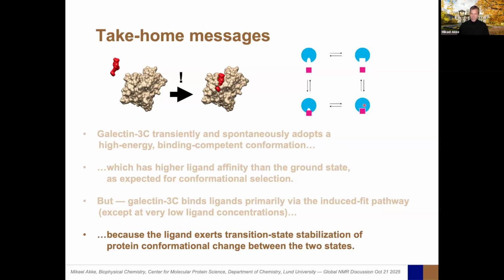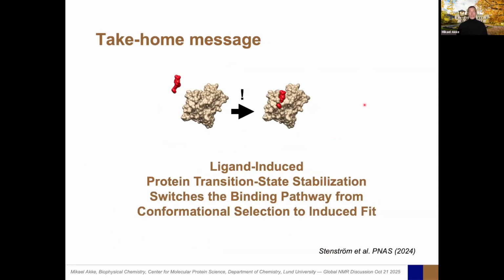So you could frame these take-home messages in what actually became the title of our paper that we published last year in PNAS: Ligand-induced protein transition state stabilization switches the binding pathway from conformational selection to induced fit. So now, in the remainder of the talk, I'll tell you how we did this.